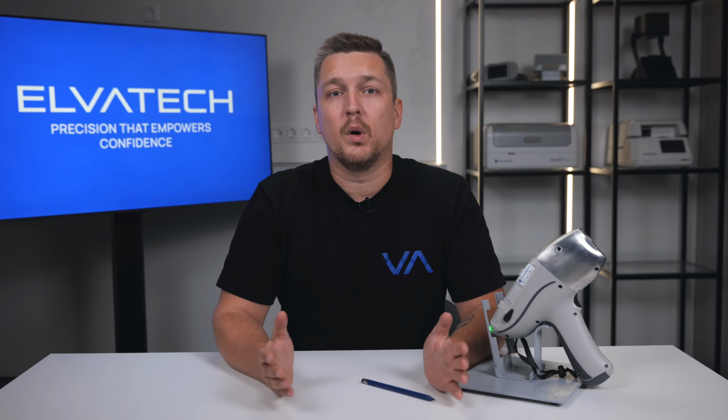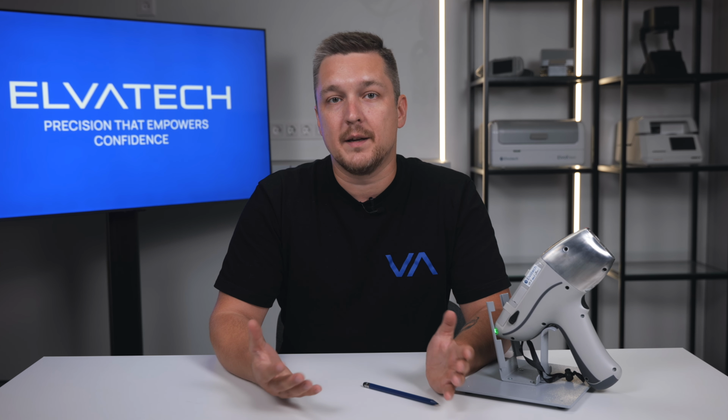In the next episode, we will dive deeper into configuration, taking measurements and making the most of all its capabilities.